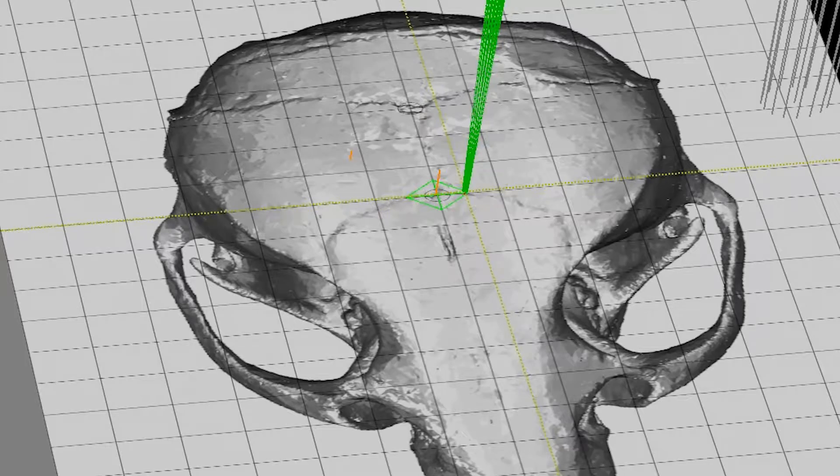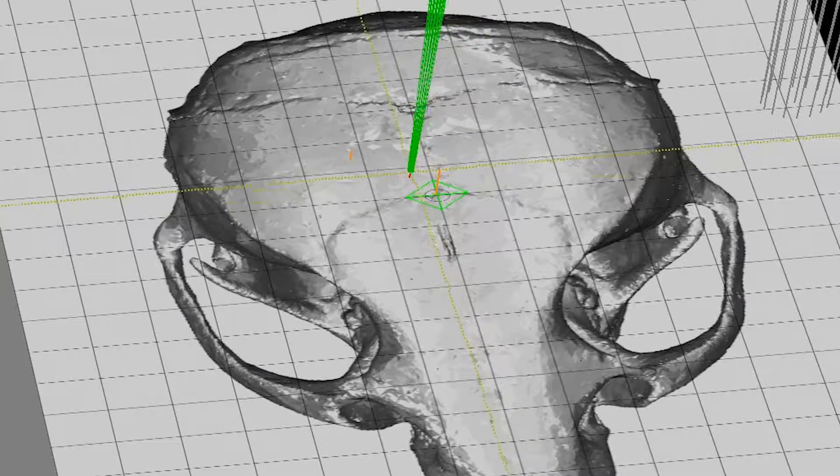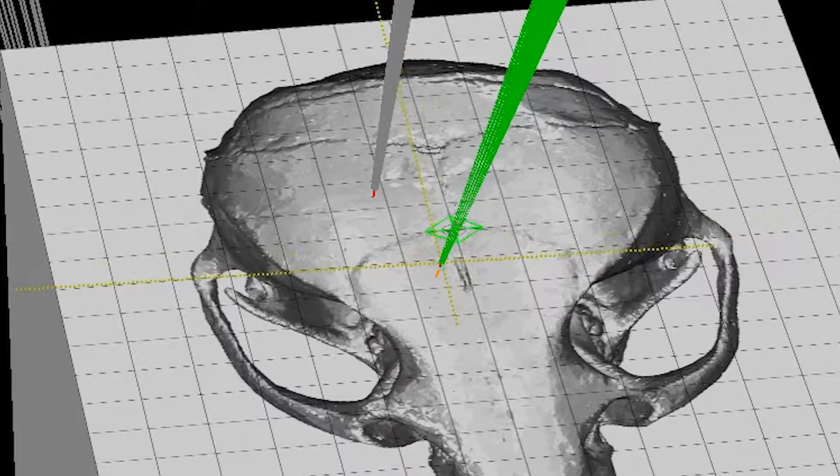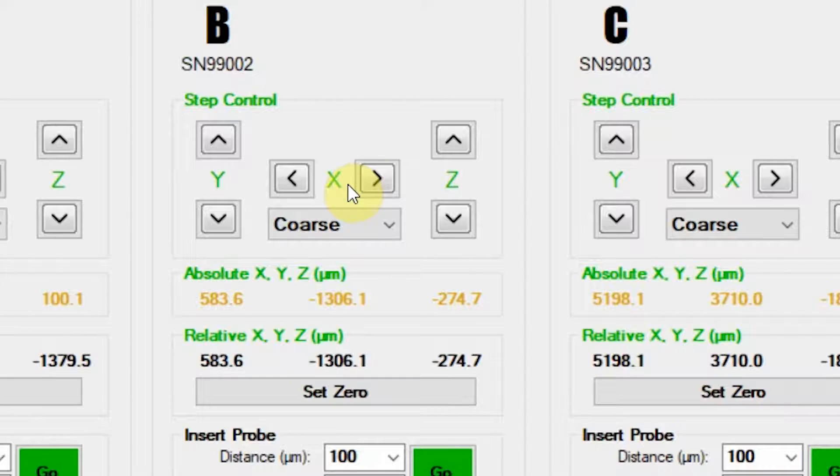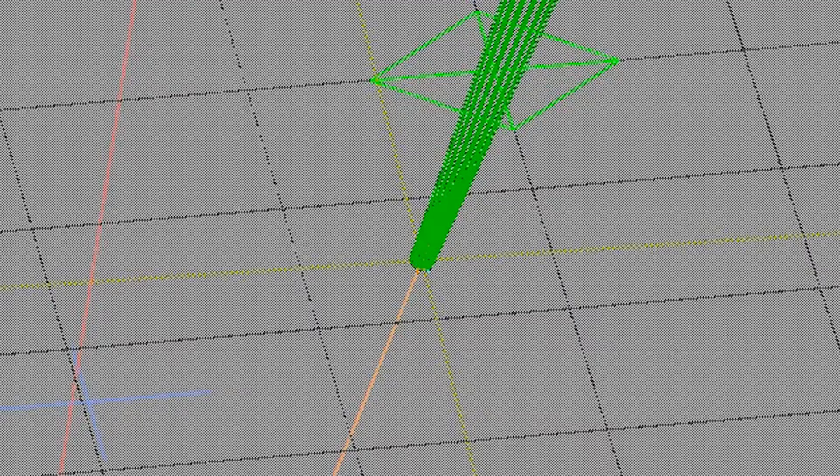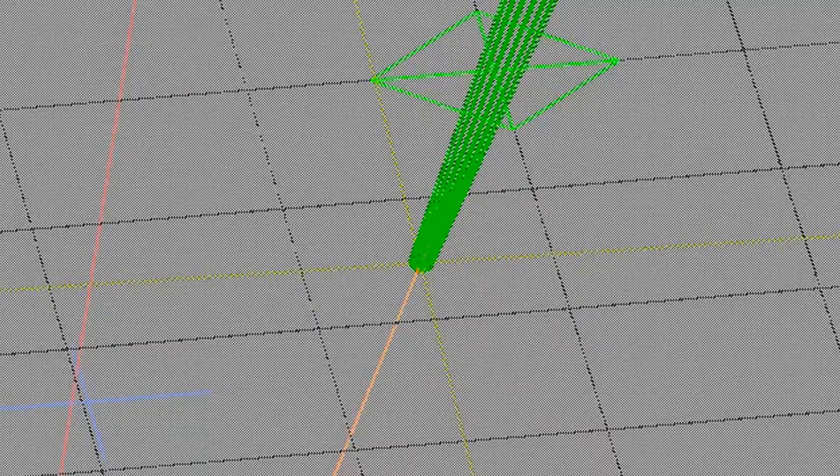An additional value of the virtual simulation within the program is the opportunity to see your process in action before working with the physical animal. The result of the virtual coordinate system is less time spent on calculations and more time for your experiment.